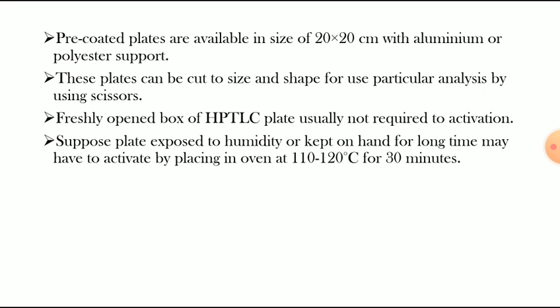A plate exposed to humidity or kept on hand for a long time may have to be activated by placing it in an oven at 110 to 120 degrees Celsius for 30 minutes.